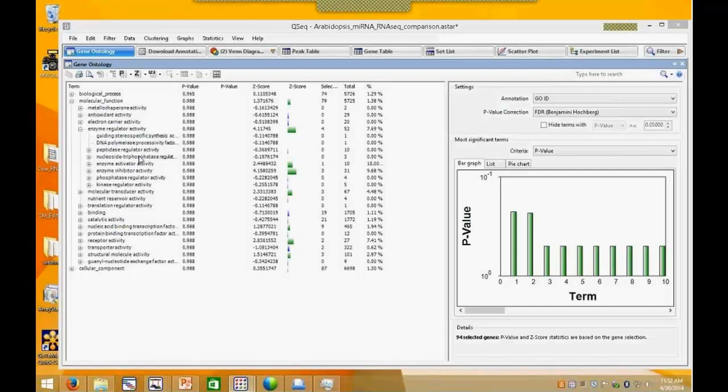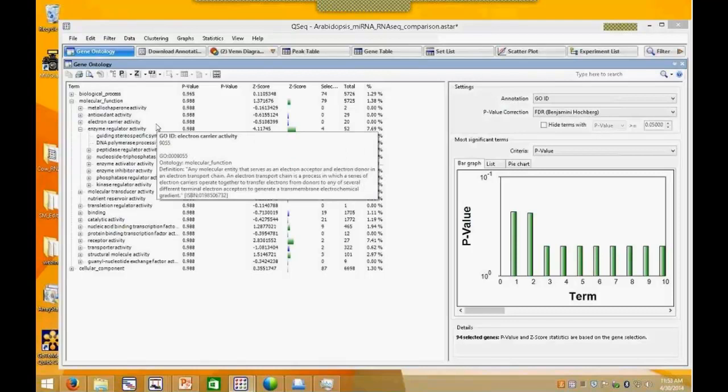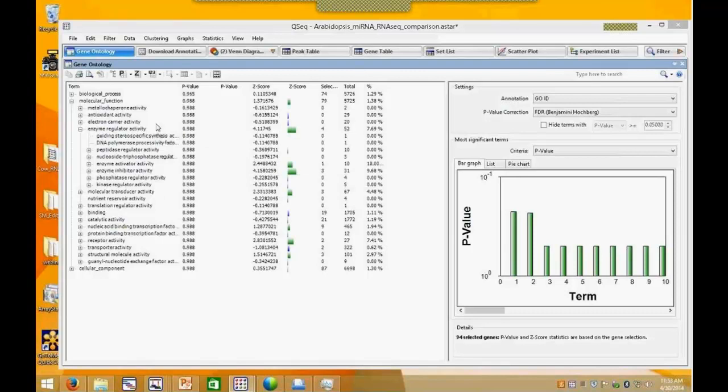So if you look back now, as we wrap up here, depending on what your needs are with microRNA, the Genomics Suite offers all different options for you. Ranging anywhere from quantification against a reference set of microRNA sequences to novel discovery through de novo or alignment back to a genome. And you can also use the tools to compare microRNA to RNA-Seq or other types of data like ChIP-seq and make comparisons between two different data types.